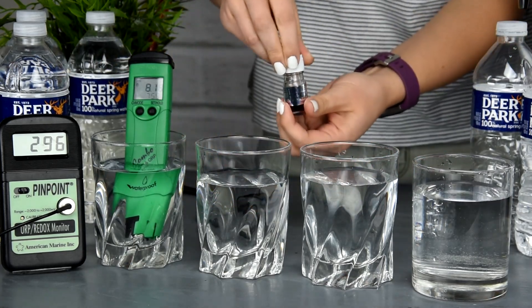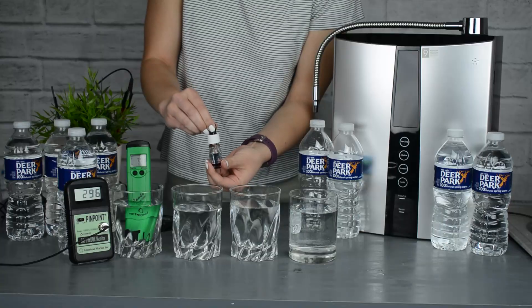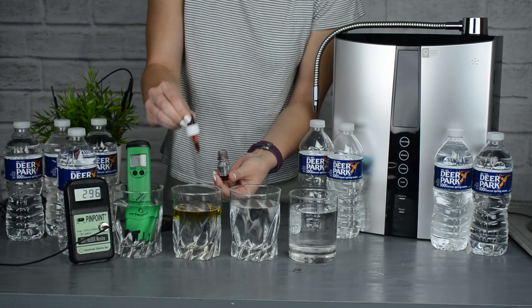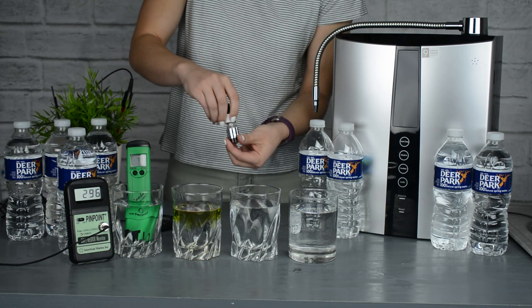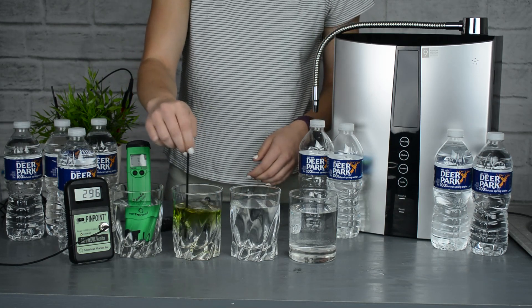Next we're going to grab the pH reagent drops, put a few in the second glass, and the results quickly show that it's around a 7 pH as well, with the color being around a green — meaning that the water is neutral.